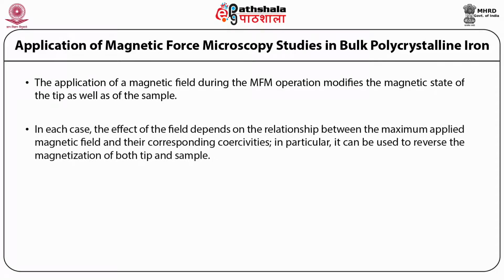In each case, the effect of the field depends on the relationship between the maximum applied magnetic field and their corresponding coercivities. Basically, in particular, it can be used to reverse the magnetization of both tip and sample.